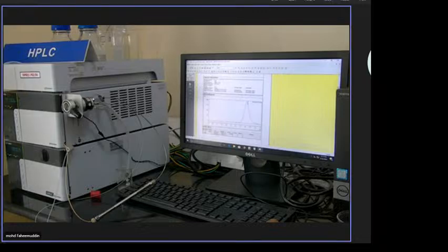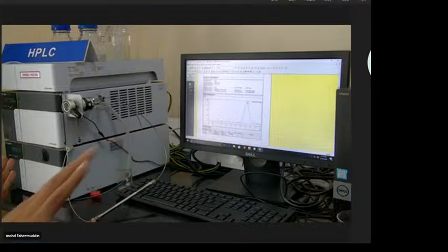Okay, 0.1 means 7 lakhs, 0.2 maybe 10 lakhs, 14 lakhs, 13 lakhs. Put all of them in the standard graph, concentration against area under the curve, and you will get the graph, linear graph, standard graph.